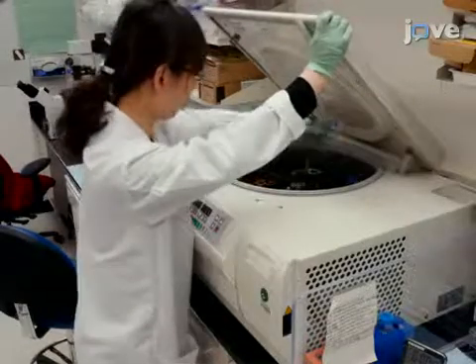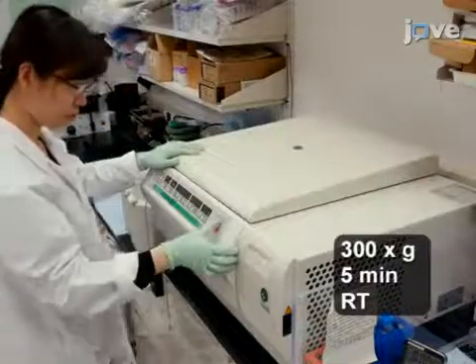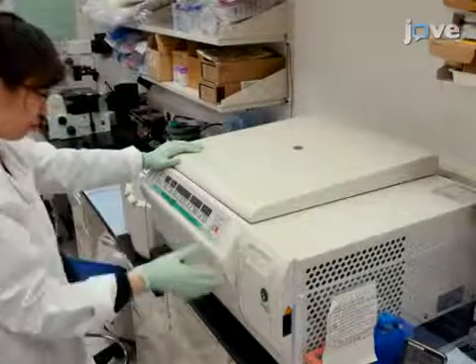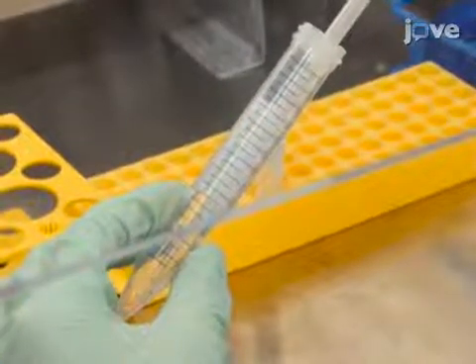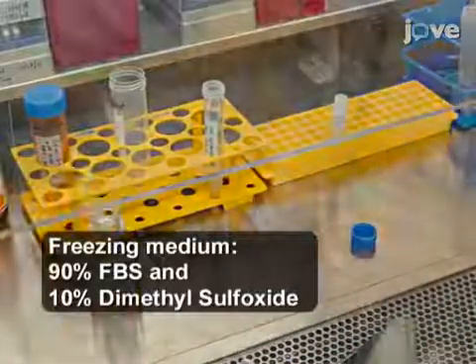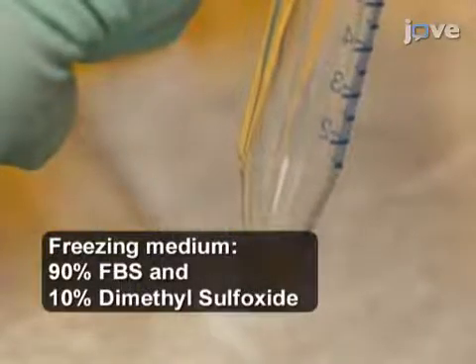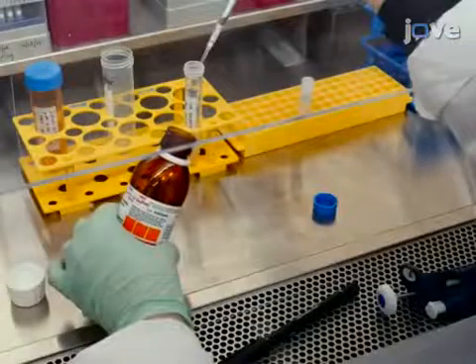Next, centrifuge the monocytes in a 15 mL polypropylene tube for 5 minutes at room temperature. Then, remove the supernatant and gently re-suspend the cells in FBS followed by dimethyl sulfoxide to achieve a final concentration of 90% FBS, 10% dimethyl sulfoxide, and 50 x 10⁶ cells per mL.